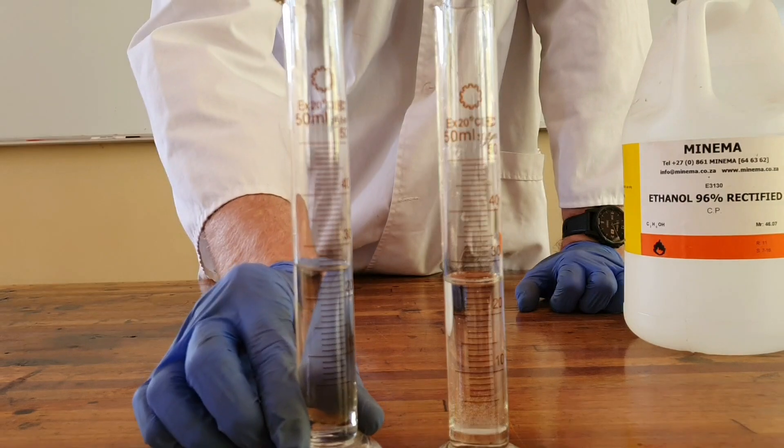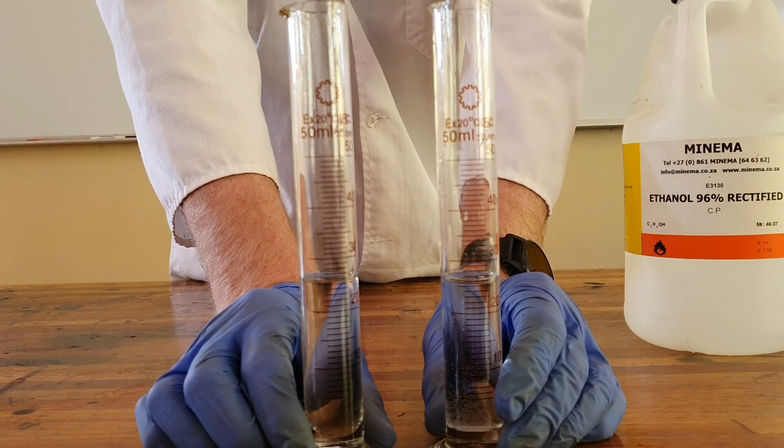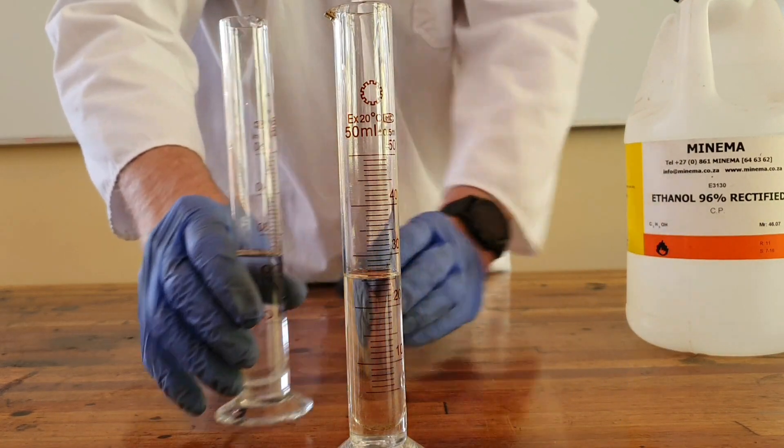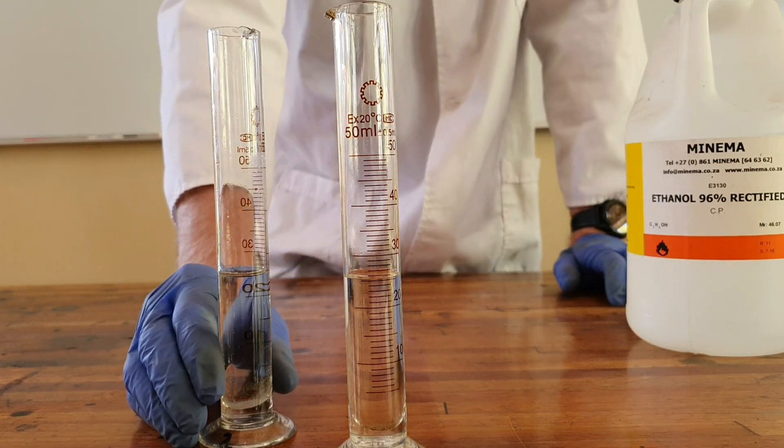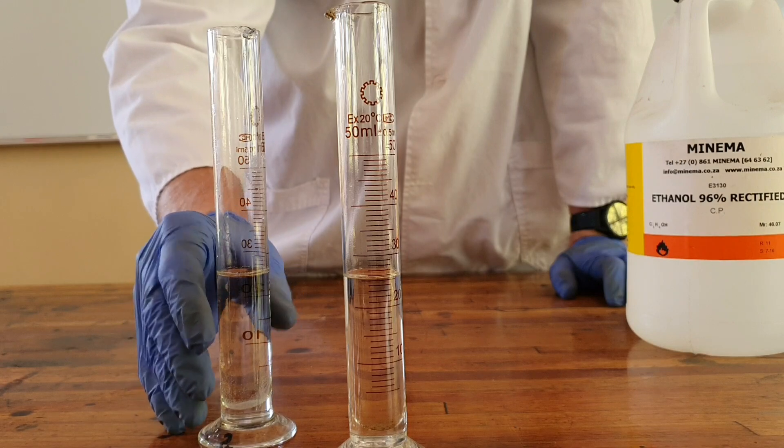The bottom of the meniscus is marked as 25 milliliters for ethanol and for water. And what I am going to do now is pour the water into the ethanol. Logic would tell us that when we add 25 milliliters to 25 milliliters we would form 50 milliliters of a substance.